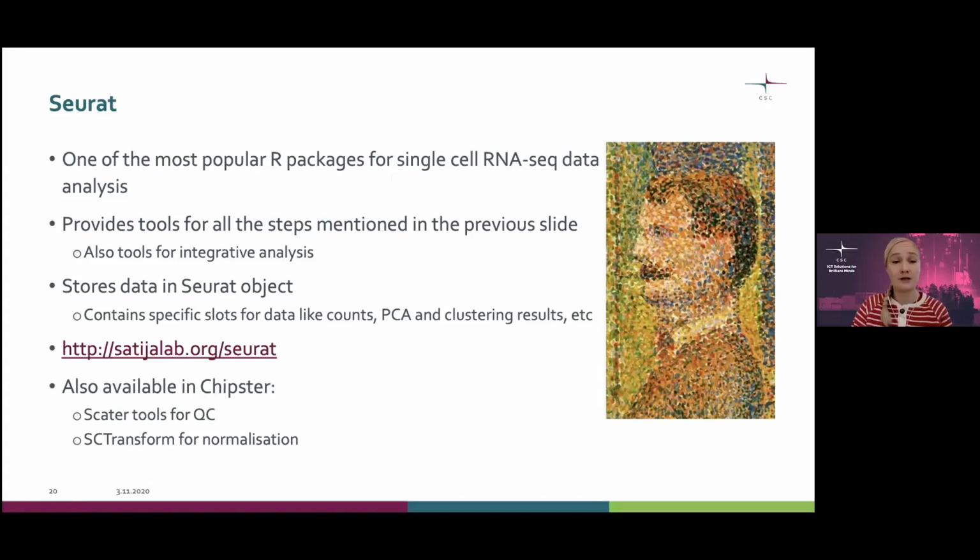And similarly, we store the data in these Seurat objects. So it's a massive object that contains all the information in one big block. And in Chipster, you can move these R objects back and forth. So you can import them from R to Chipster, and again from Chipster to R, if you want to move between these two platforms.